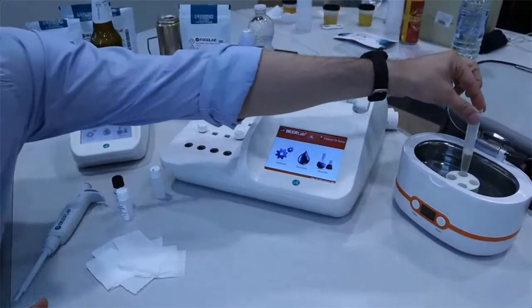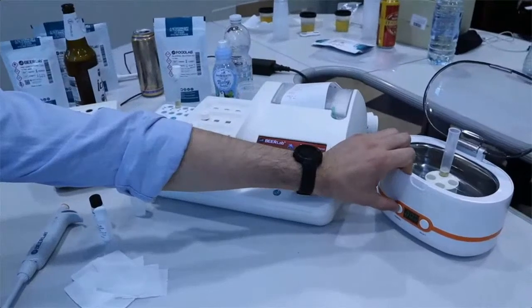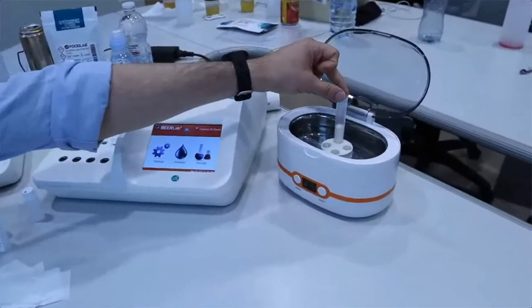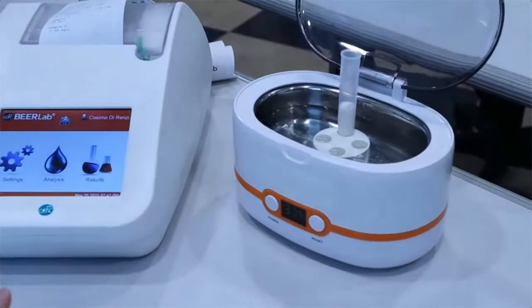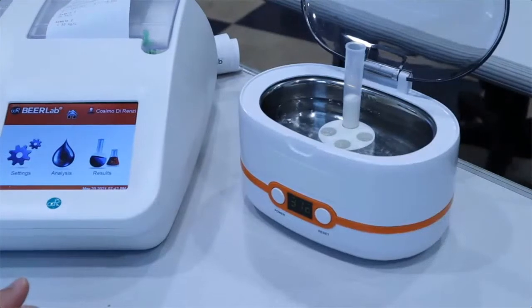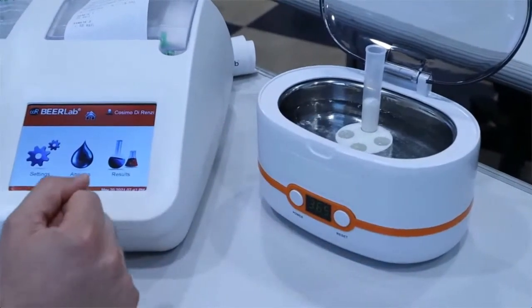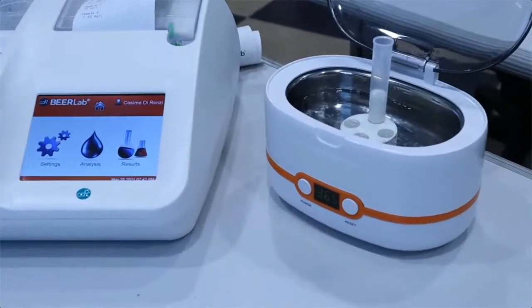Here we have an ultrasonic bath, and we can power it up, and easily we remove half the CO2. So after 2 minutes, you can easily collect your sample. Okay.